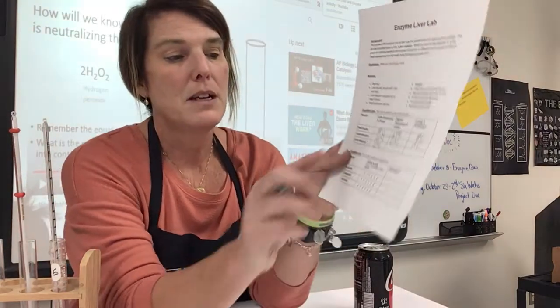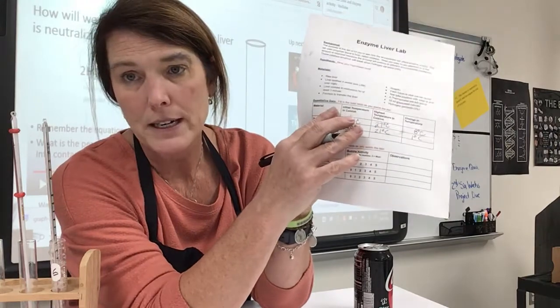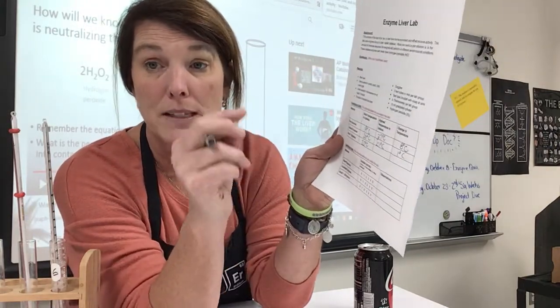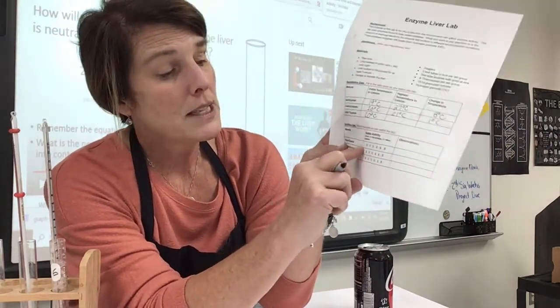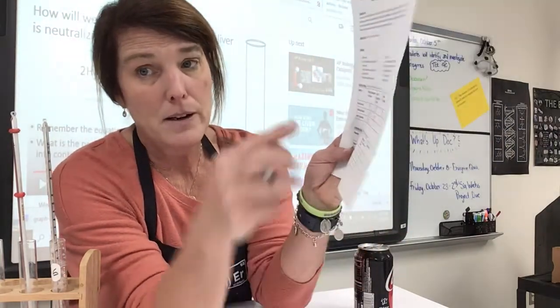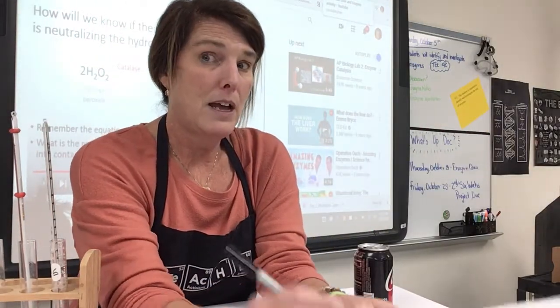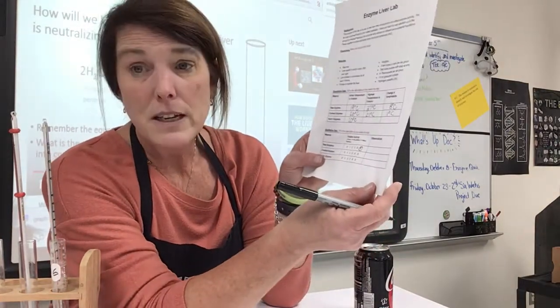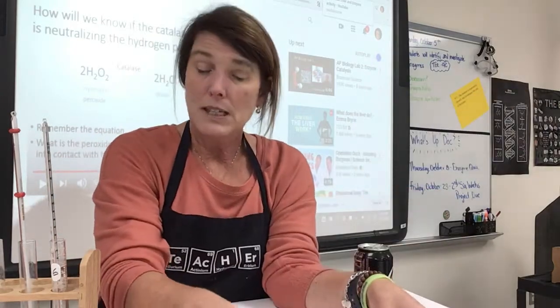Now, notice that when I am writing a temperature, that is under quantitative data. Quantitative data means data that you give a number to. It has a quantity. There's also qualitative data. You have to decide that. Raw enzymes, personally, I thought it was a lot of bubbles. So I'd probably go more on the 5 scale because it's made a huge mess on the table. Cooked enzymes, well, not too many. So you decide on that one.